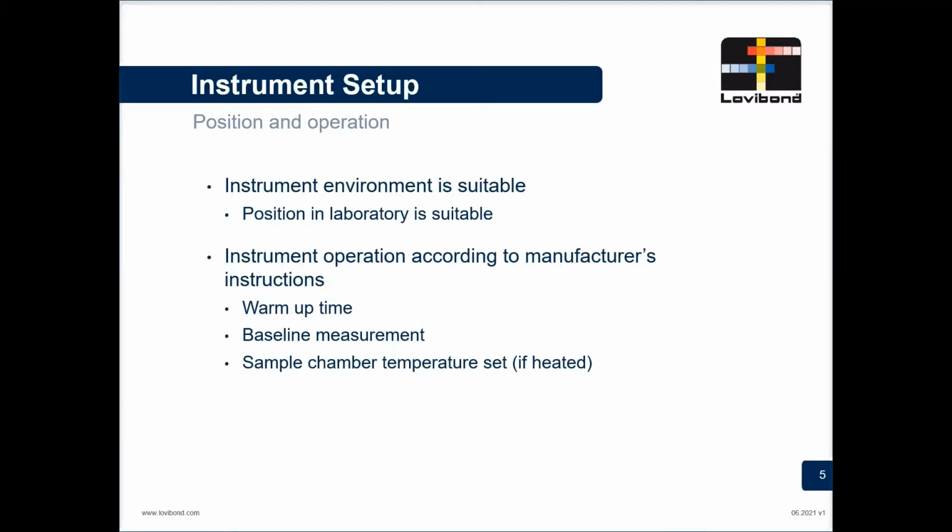The visual standards will mention that you'll need to site it in a part of your laboratory where you've not got direct sunlight shining on your instrument. Having direct sunlight shining on your visual instrument means that you have this distracting light while you're trying to do the colour match. You need to site it in an area where you don't have direct sunlight.